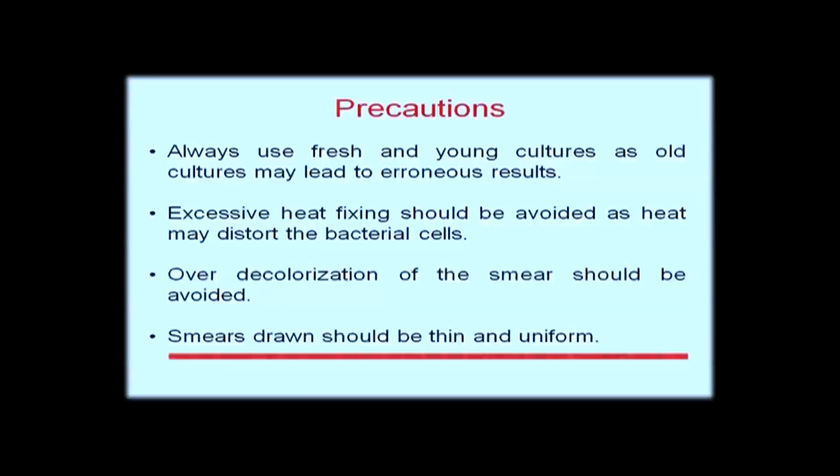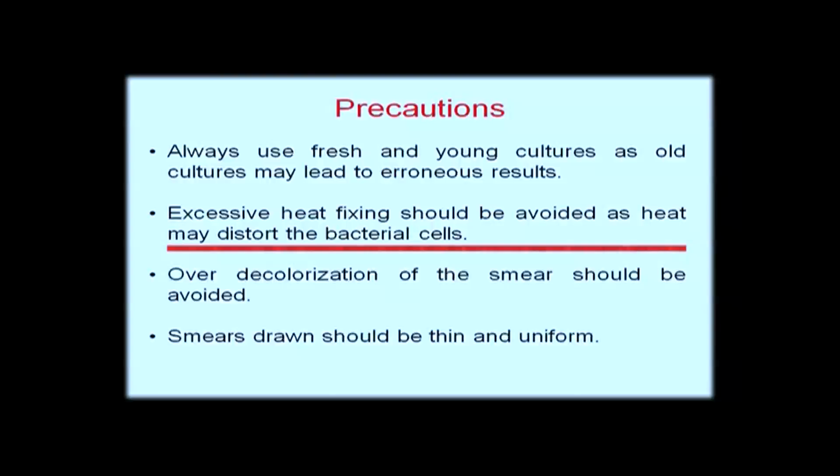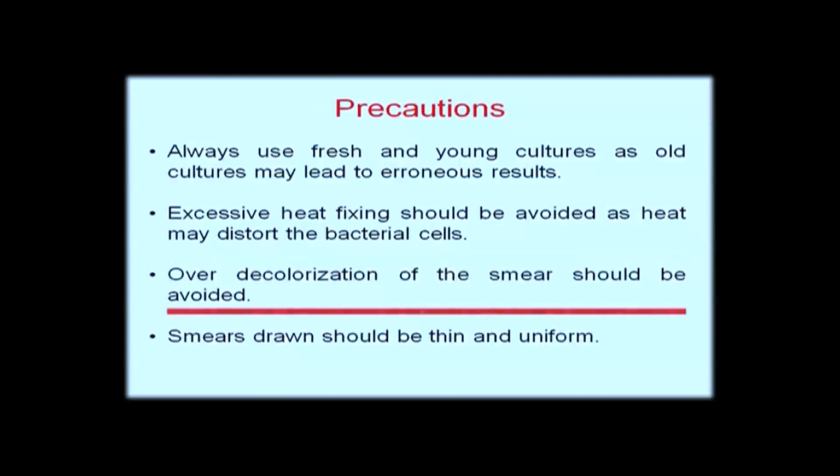The smear which is drawn should always be thin and uniform. During the heat fixation step, overheating of the smear should be avoided. The third point is over-decolorization of the smear should not be done. So, if we follow these precautions, then we will be able to get good results during the gram staining method.